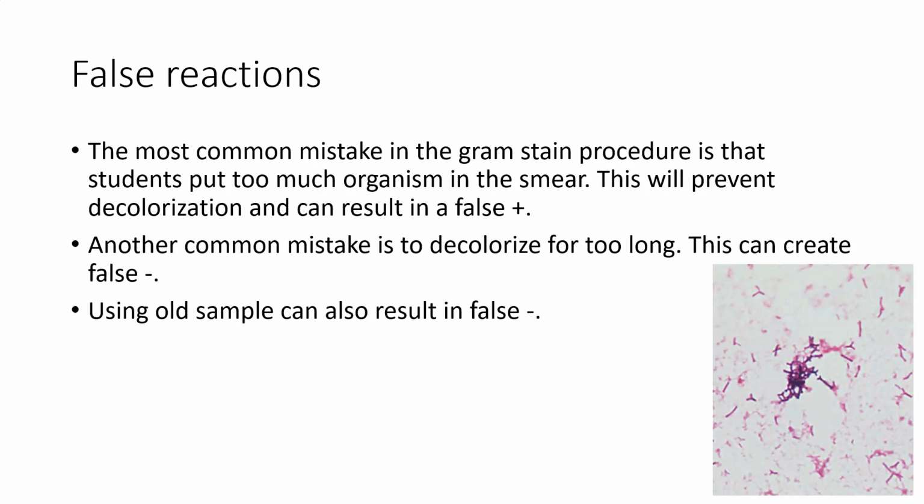We will usually give you fresh samples, but it is important to know that if you use an older sample, it will tend to give you a false negative result. And so that's something that we'll just prepare for you.